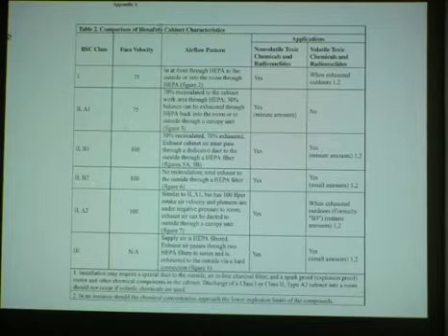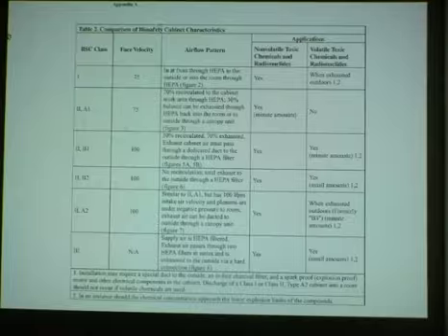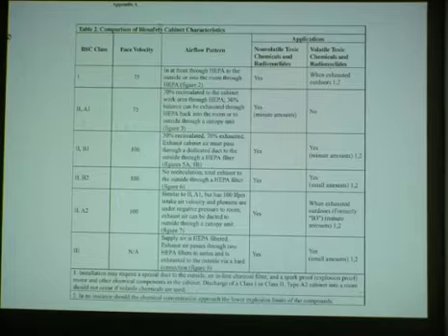The air could be released back into the room after HEPA filtration or could be canopy fitted through a thimble unit to an exhaust duct leading outside. One of the reasons why you find class 2 B1 followed by class 2 B2 and then class 2 A2 is because formerly, until the last revision of the NSF standard, this particular configuration was termed class 2 B3. It has been rechristened as class 2 A2.